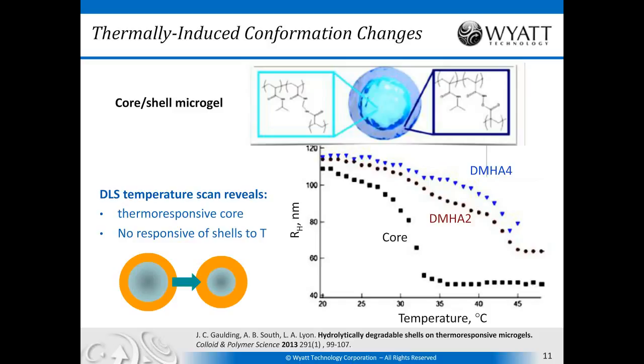And so this is a very quick and rapid type of measurement that you can do in a cuvette-based system, just changing out your samples. Probably takes no more than 10-15 minutes to run each one of these samples. It's very convenient to do that. Maybe a little bit more than 10-15 minutes.